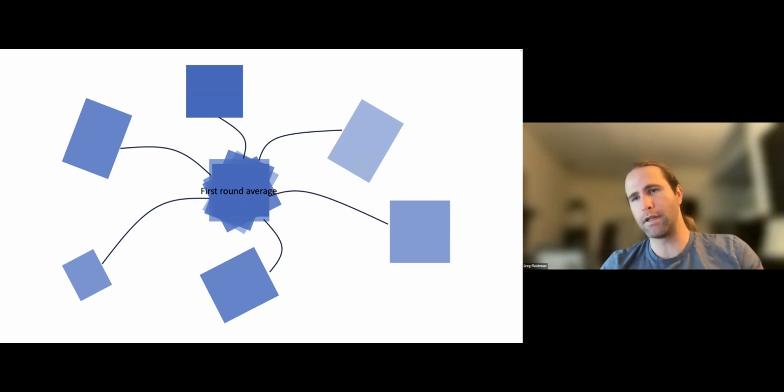Each round that you do this, the anatomy in the averaged image will gradually approach something which is equidistant in terms of its shape from all of the individual subjects. You are gradually moving away from the bias of registering all your data to one specific individual towards registering all your data to a common representation that is roughly equidistant in shape from all of the subjects in your data set.